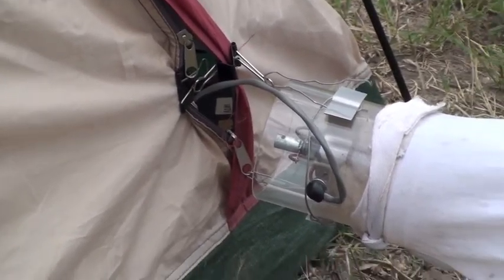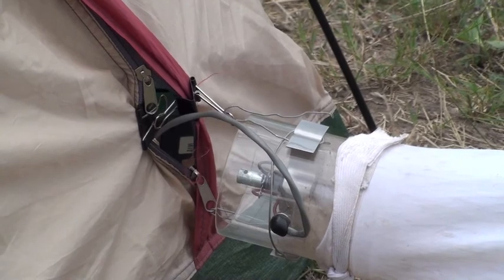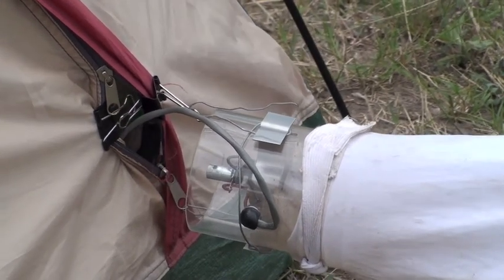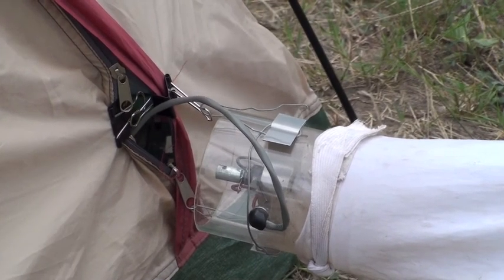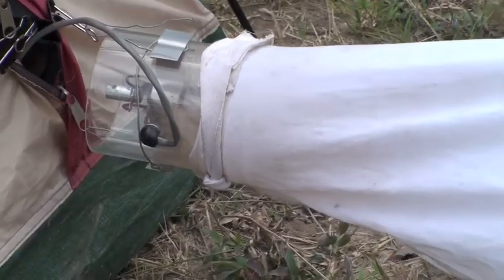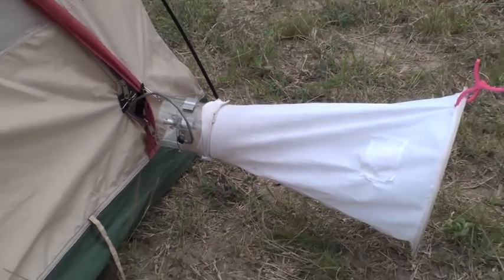This means that mosquitoes will be attracted to the odors and CO2 coming out of that opening of the tent. The tent wall acts as a surrogate lid for the light trap, which increases the suction effect of the trap body. It's not actually a light trap since we don't have a light. And then, hey presto, they're caught in the collection bag.